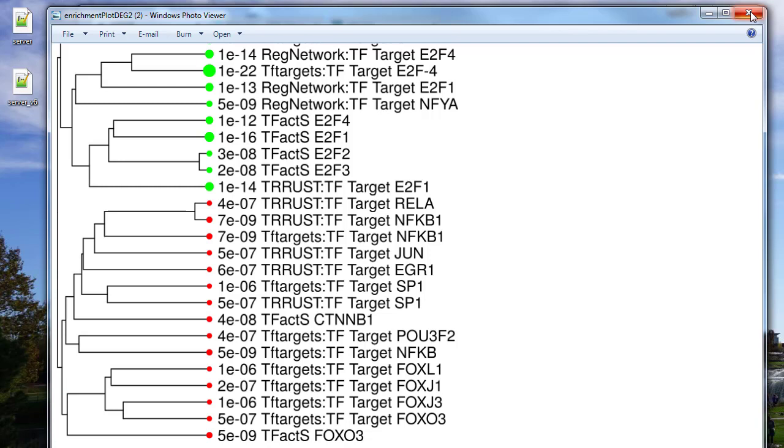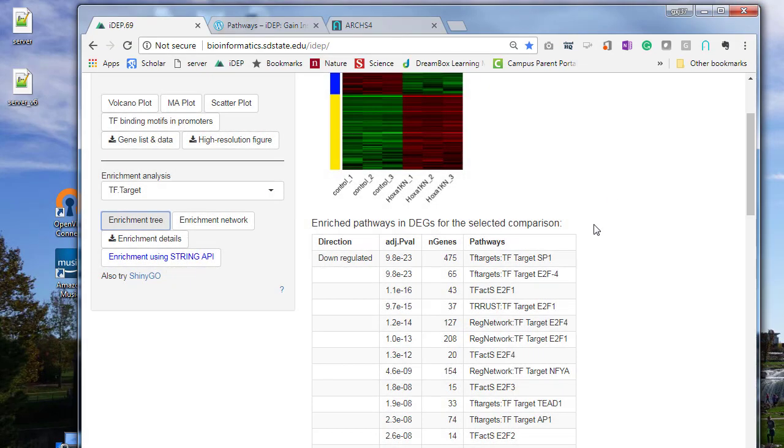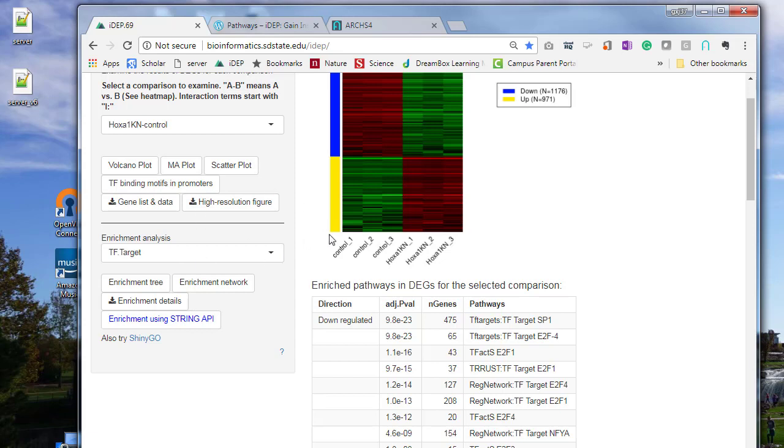It probably triggers cell cycle arrest, and at the same time triggers the immune response of the cells because exogenous siRNAs were injected. All right, so you can obviously spend a lot of time examining this.